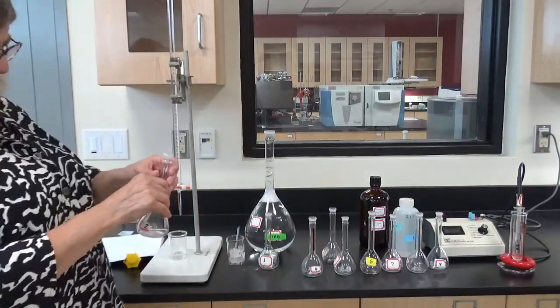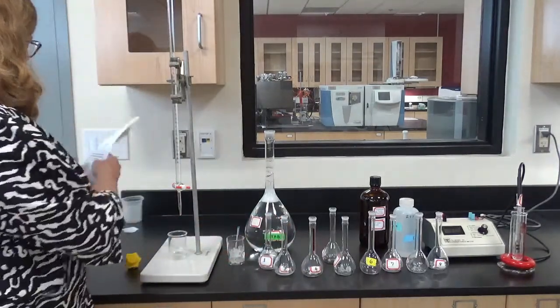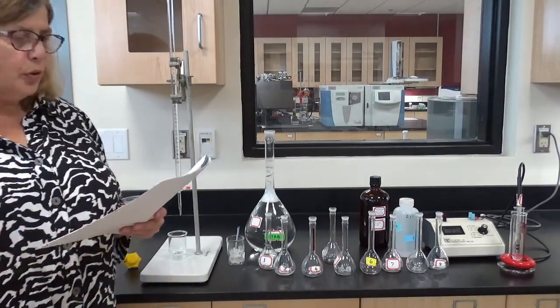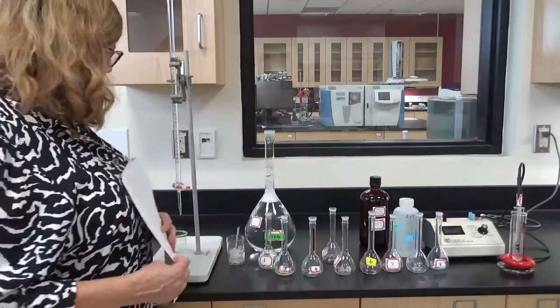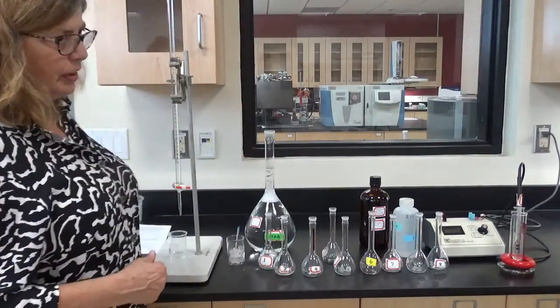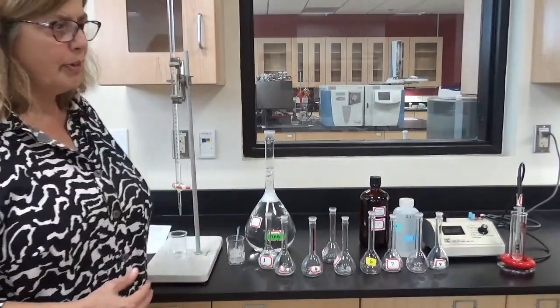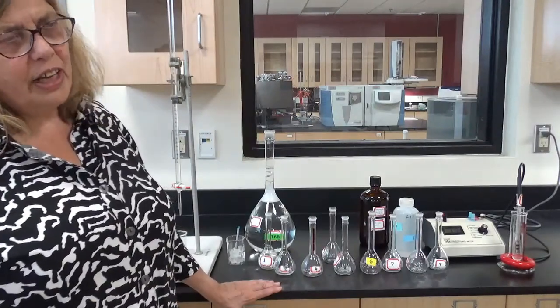So that's what I'm going to do. I added my 5 mils to solution 2. I'm going to have to add 10 to solution 3 and 15 to 4, etc. Okay, so that's what I'm aiming to do while I turn the video off. But at the same time, I'm going to get a 5 milliliter pipette, and I'll start worrying about the phenanthridine.